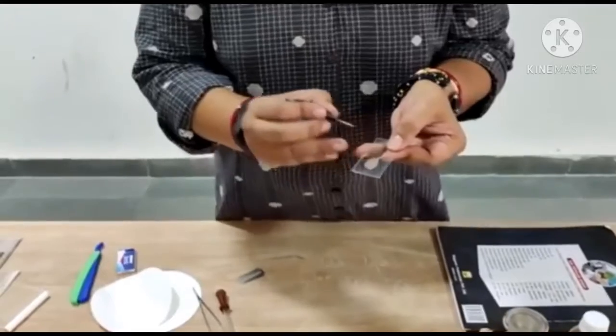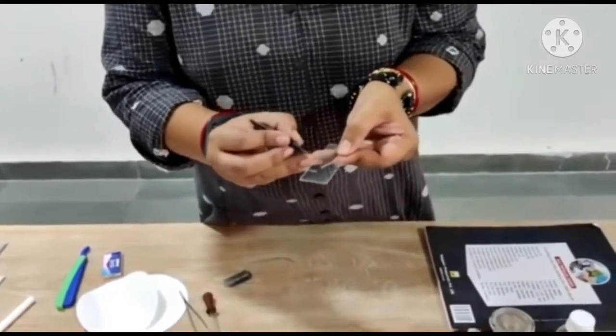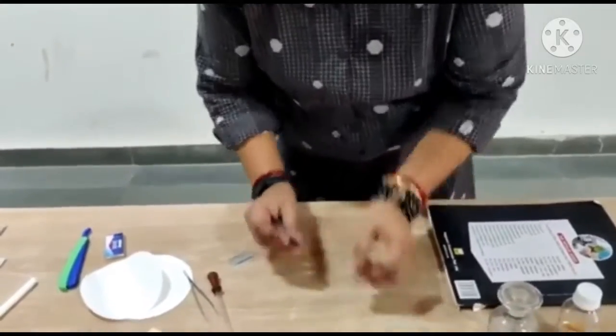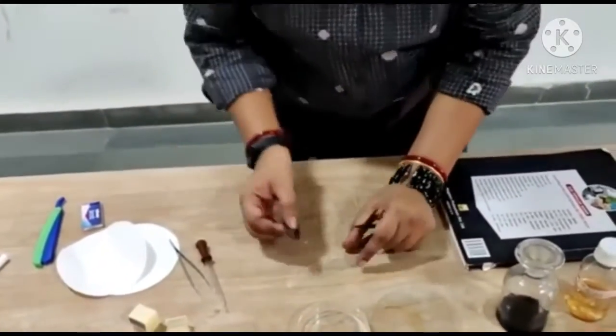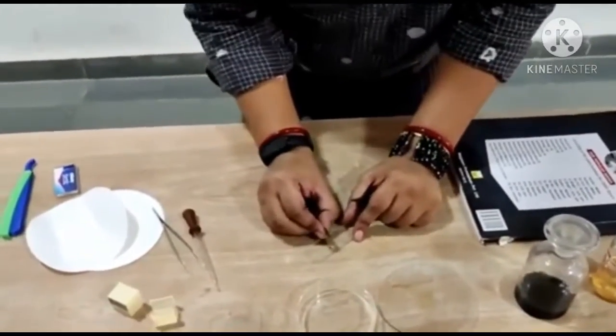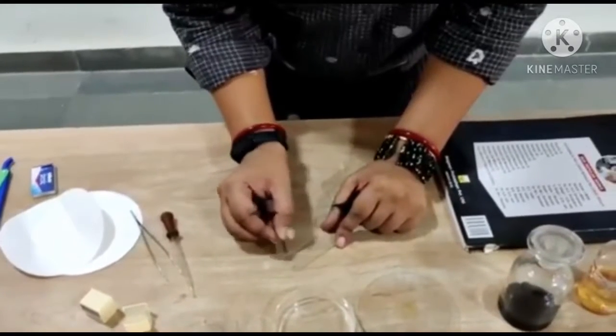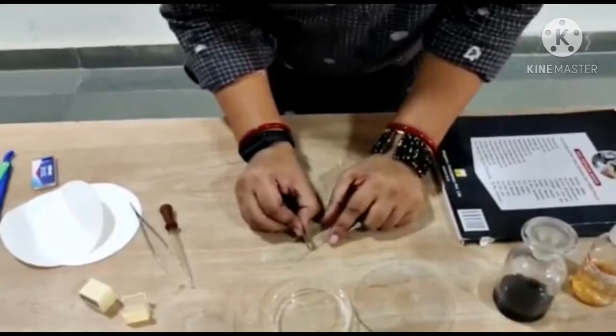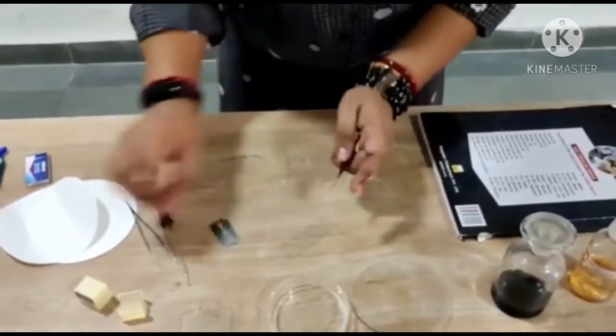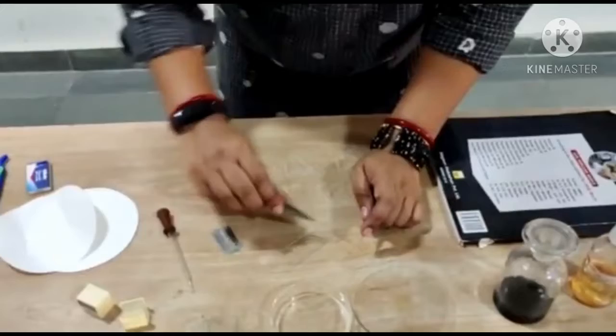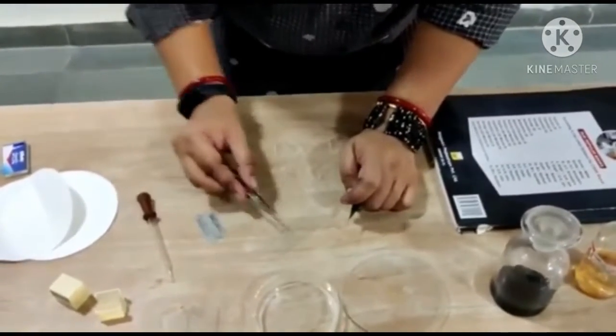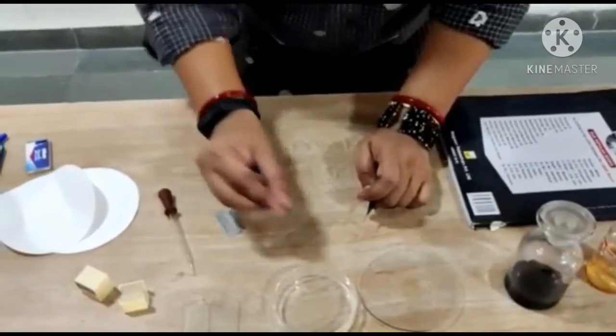Therefore, for mitosis, we will prefer the root tips of plants. We will discard the root cap portion and we will take a small transparent portion just above the root cap. We will discard the upper portion as well as the root cap portion.